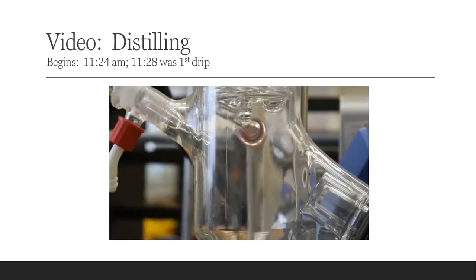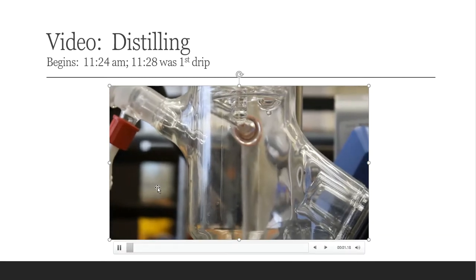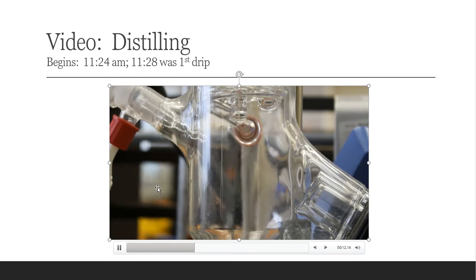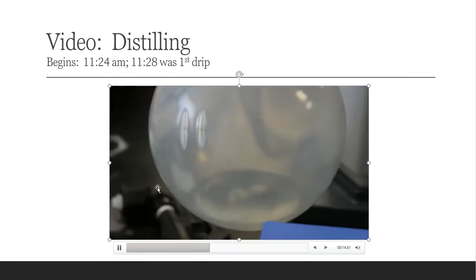All right, so I've got a video of it actually distilling, so that way you can see it live. So let me push the play button for you. Okay, at this point I'm seeing my first drips from the rotovap. Look how fast it's acting and behaving, which is a very good sign. It's working the right way. All right, so drip, drip, drip into the receiving flask that we're going to see below. There we go. So all of that is my reclaimed pet ether that I can reuse for another lab on another date. Folks, that's as simple as it is. That's all the rotovap really is, an automated, already set up, simple pot distillation.